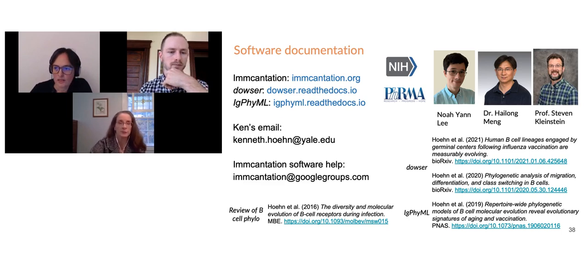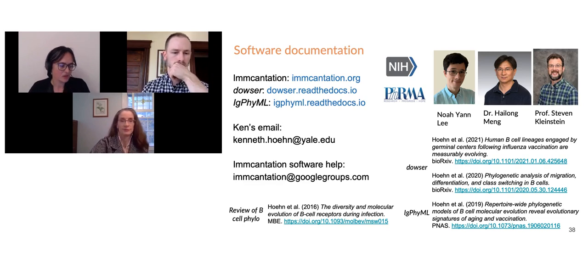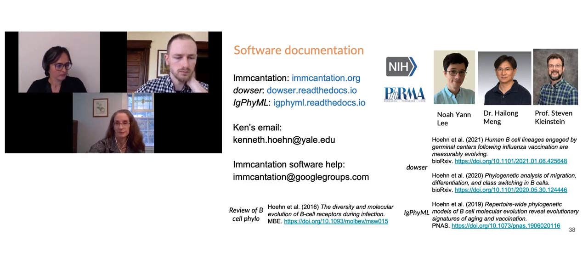I can pick one because I prepared a link for that one already. It's the one: how much improvement do we get on the B-cell clonal clustering by adding the light chain? There is a little improvement, but not much. We have methods that subdivide the clustering using also the light chain information. But we have a paper from the lab that I'm going to put the link here, if I figure out how. Okay, yes, here. We show that there is not much improvement, that just the heavy chain is enough to do the clustering.